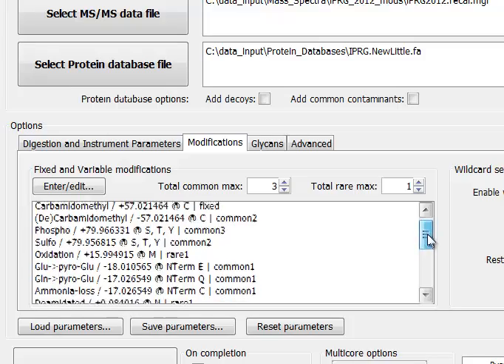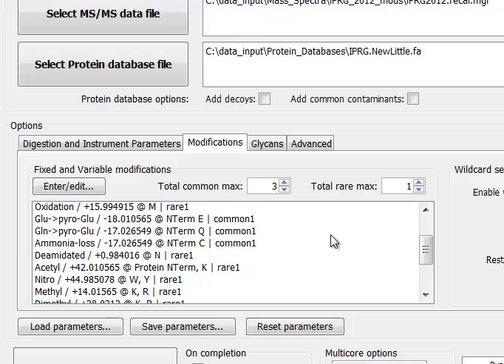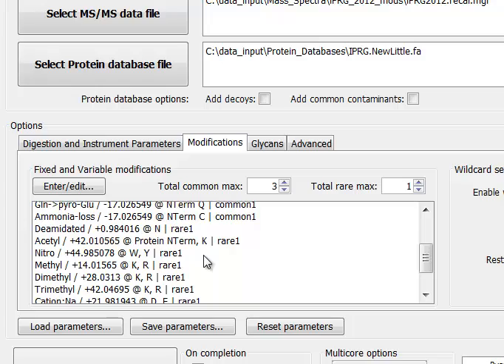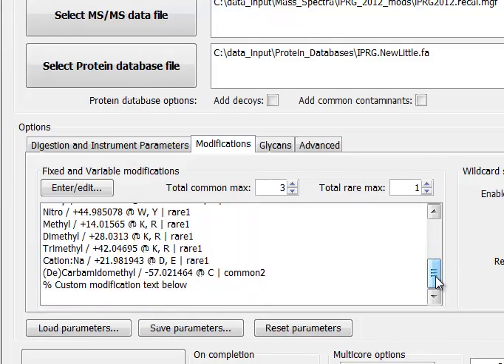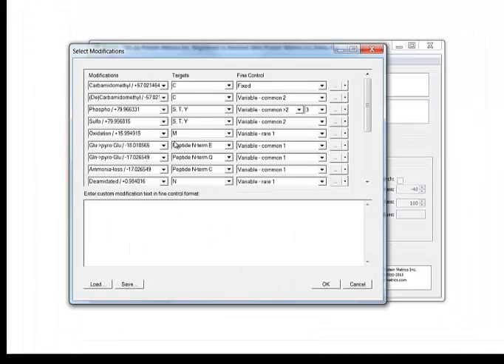Let's go further and look at more modifications. Here we see pyroglutamate, deamidated asparagine, acetylation, and so forth. We have a total of about 20 modification types, where each residue-mass pair is considered a modification type.